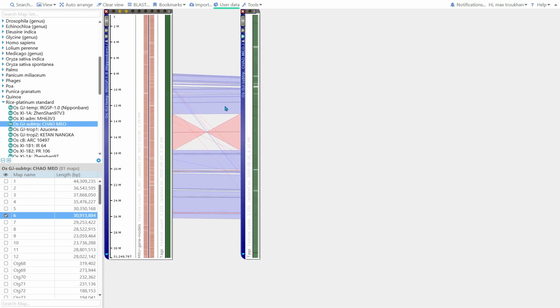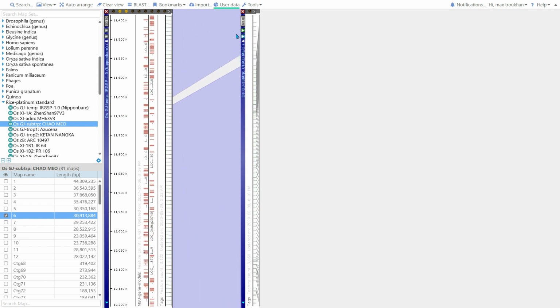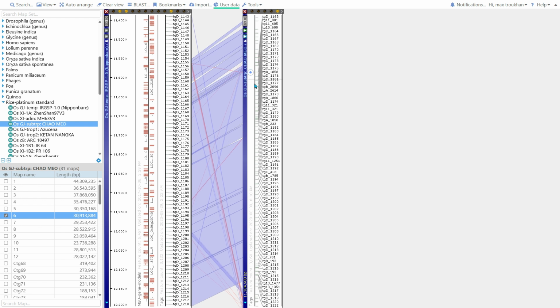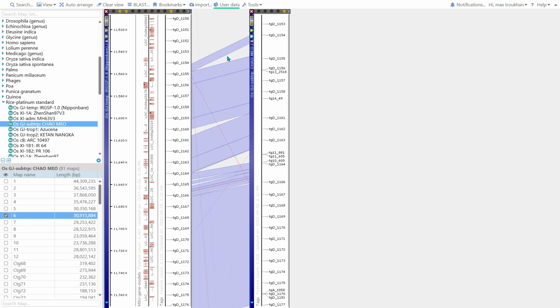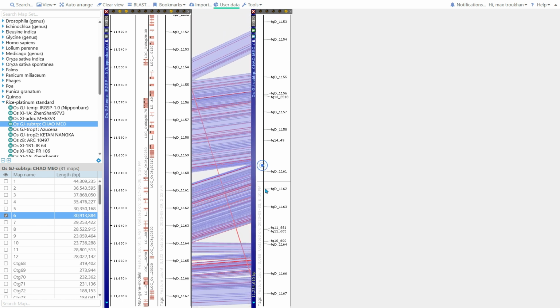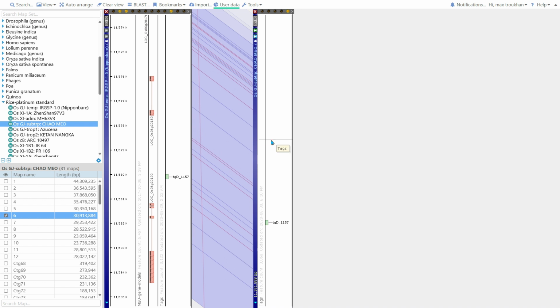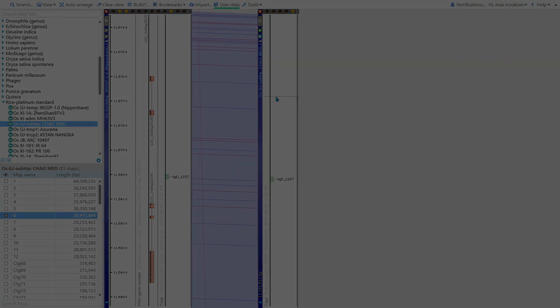Once the visible segment covers less than 1 megabase, the button for BLASTN becomes enabled. The amount of details in the BLAST hits can be overwhelming, so, at lower zoom, we should be ready to see just the HSP outlines. Once we zoom in deeper, the HSPs will be shown with all nucleotide mismatches and indels. The edges of small indels are drawn in red color so that you can distinguish them from the mismatches without zooming in to the single base level.